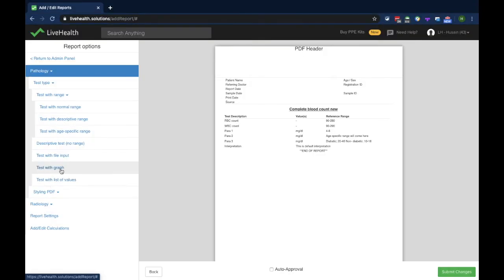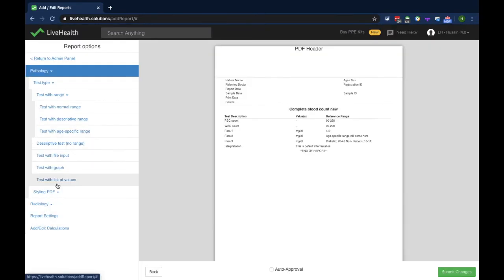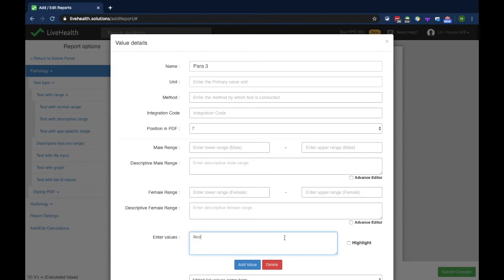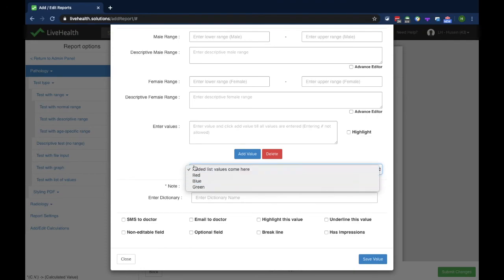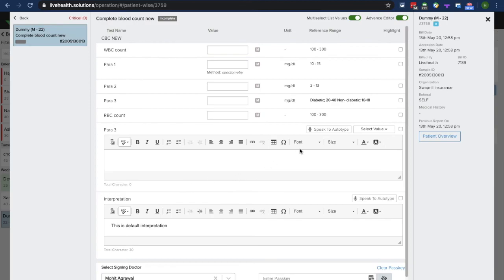Test with graph is used if you want to show a graph on the report. Test with list of alias is useful when you want a dropdown selection on the report. For example, I can name a parameter and enter dropdown values such as red, blue, green. After clicking add value, all these values appear in the dropdown and will be available while filling the report.